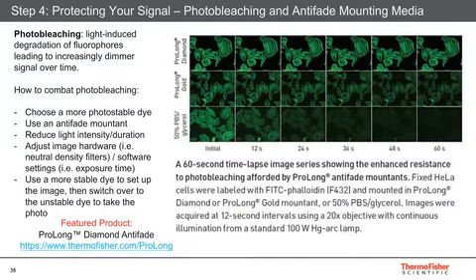But what else can you do? Well, you want to reduce the light intensity and the duration that it's on the sample, because the stronger the light, the longer the light, the more photobleaching you have. So you want to be quick about imaging, about setting it up. If you use a traditional microscope, you might even throw in a neutral density filter while you find the cells of interest. Now, if your dye is so sensitive that it photobleaches away really quickly, even in an antifade, then you might want to consider having a second dye, like DAPI, for instance, that you can use to find your cells and set it up, and then you quickly switch over and take the image in the dye that's not as stable.